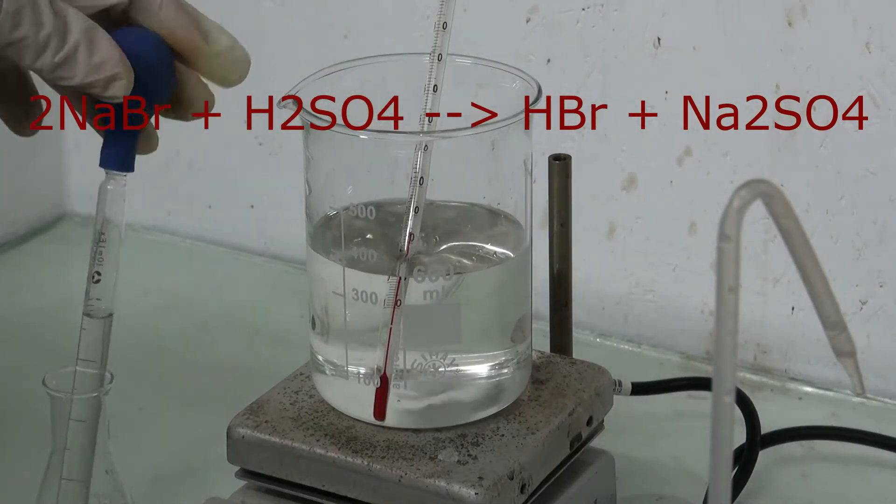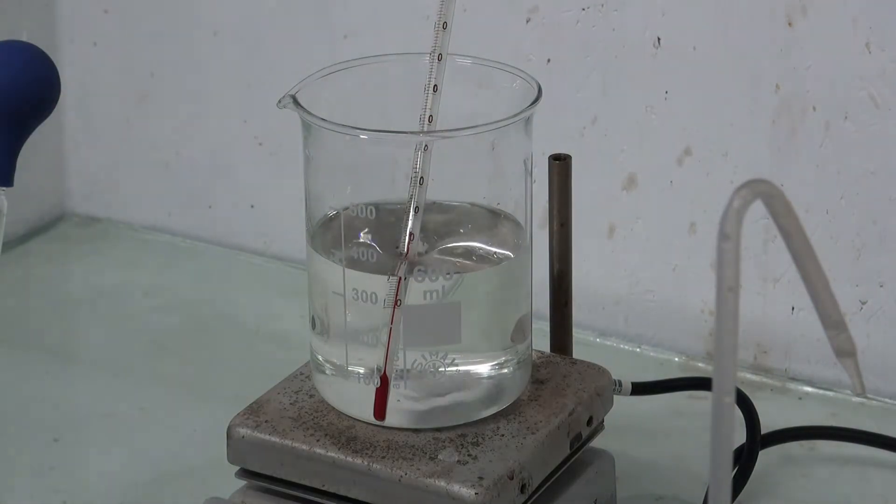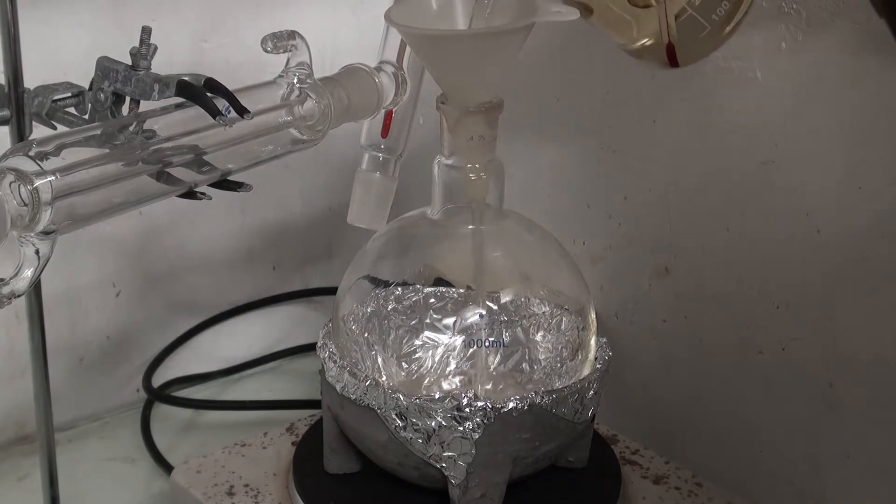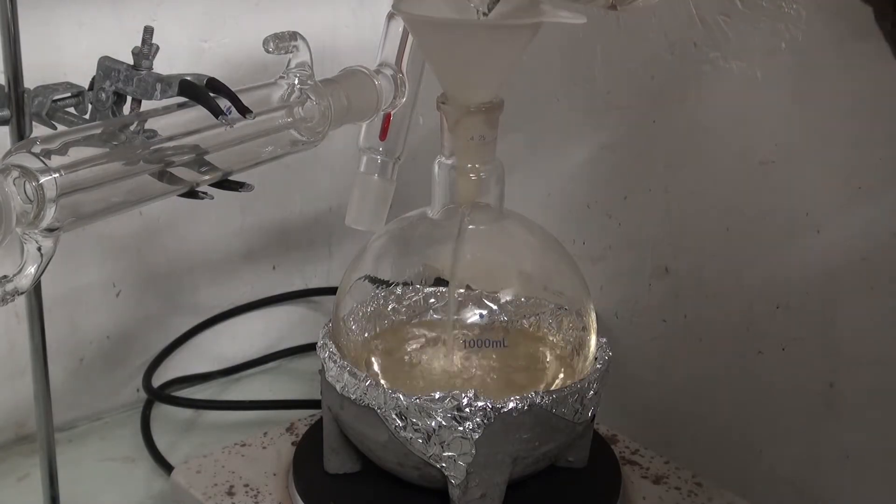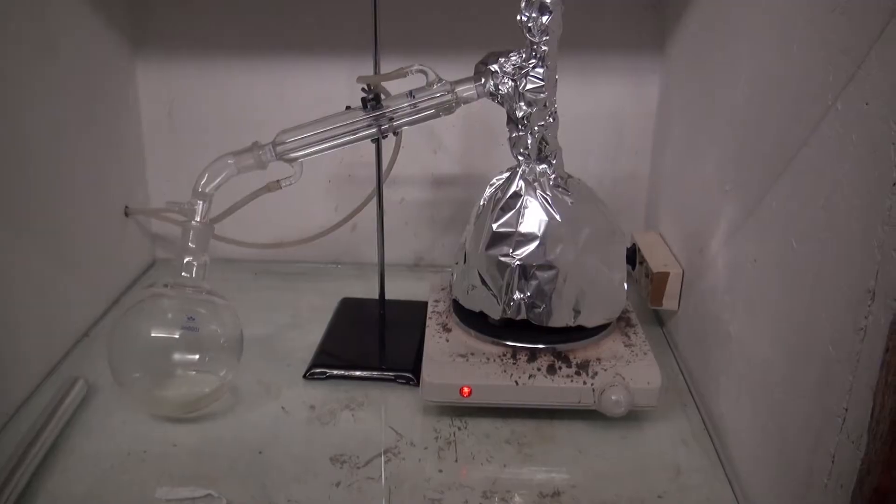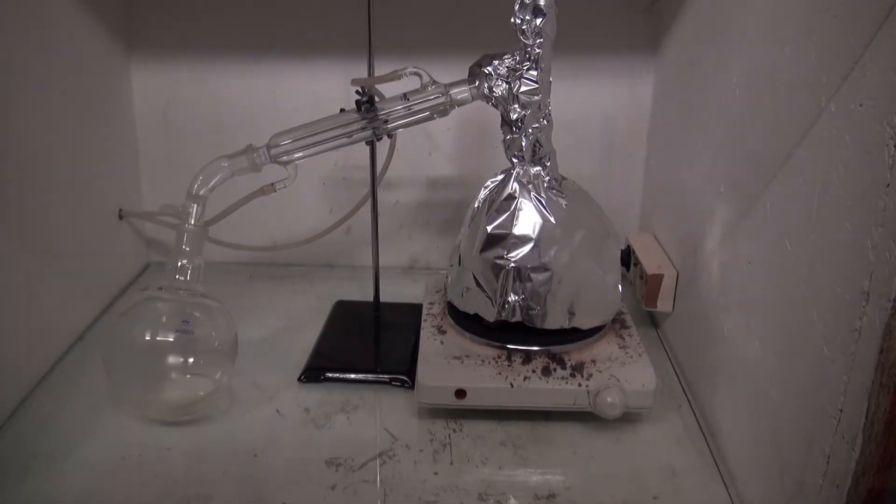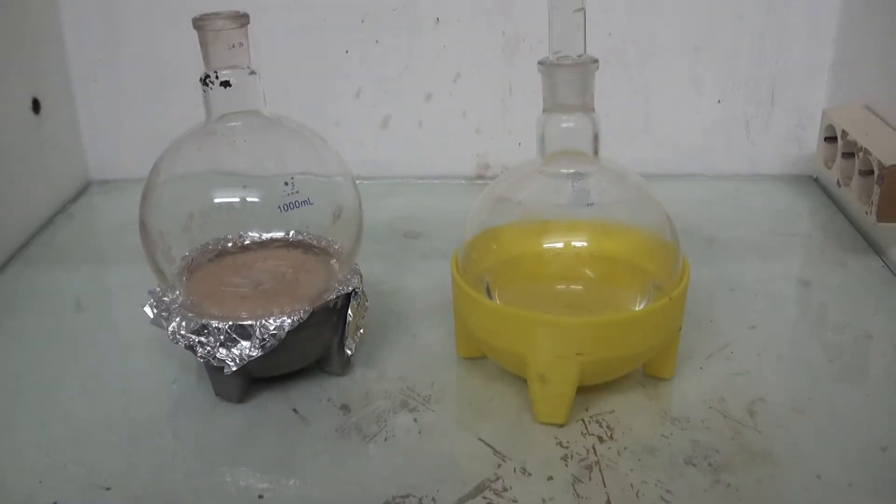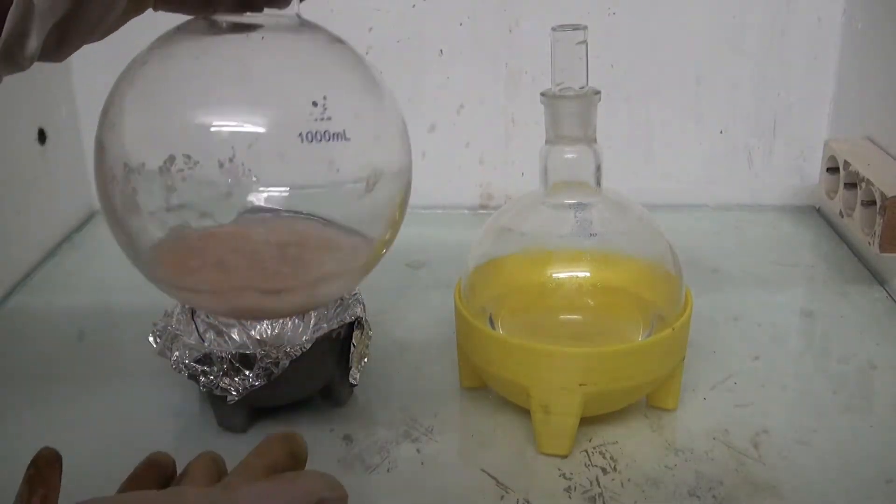I mixed it with 1 mole of sulfuric acid and then distilled it off. With this step I probably lost about 50% of my hydrobromic acid.